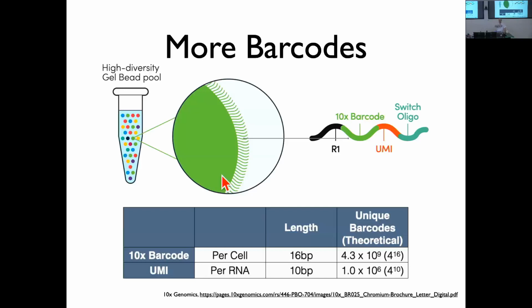So all the oligos in the A beaker get an A added. So all the oligos on one bead get an A added. And just keep on doing that for, what did I say, 16 base pairs? Yeah, so you do that 16 times, and then you've made sure that you added the same base on all the oligos on a given bead.